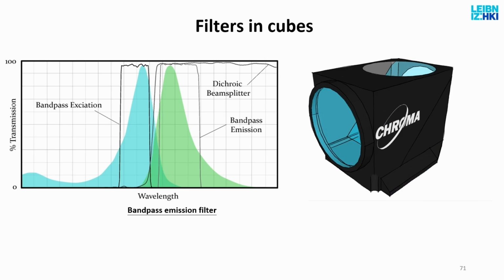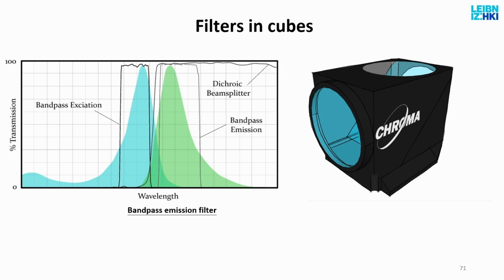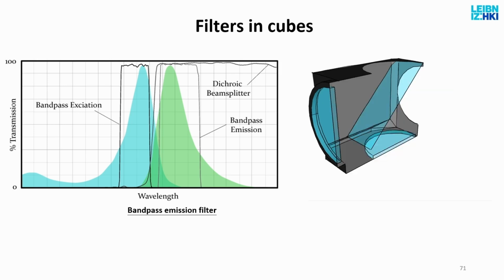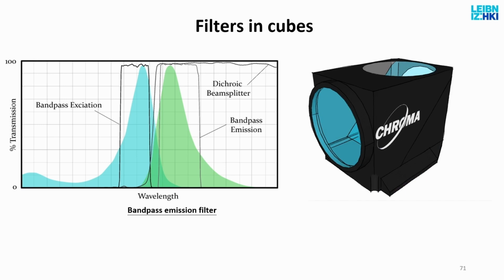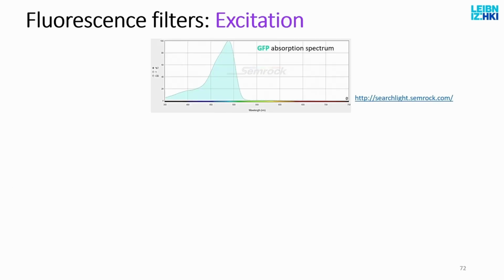And if you have a new dye, which has a unique wavelength, like, let's say, it's not unique, but for example YFP, 514 nanometers, then you must use that label. A lot of microscopes will not have a 514 cube, then you have to buy it. You go to your group, okay, my group is able to spend 150 euros, you buy your cube, then you put this in the microscope. Some cubes will work outside their range, but the signal will then be very weak.